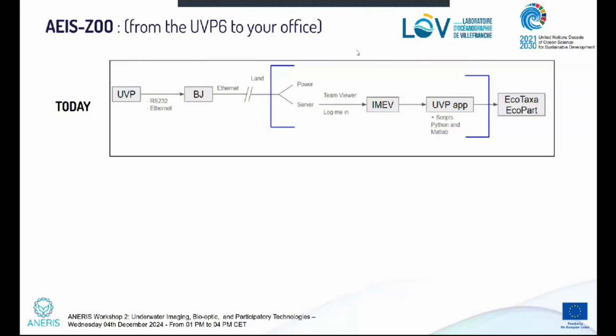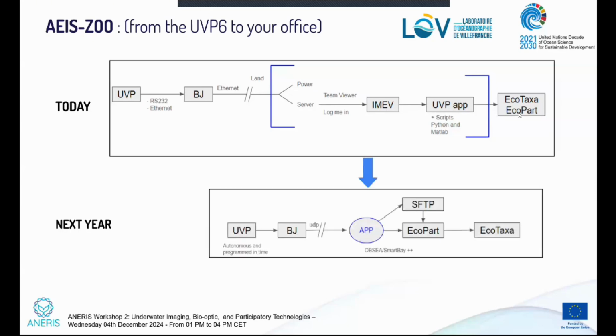Actually, we have to connect using a remote desktop application to download the data, process them, and import them in the EcoTaxa and EcoPart applications that I will introduce. Next year, there will be an application which will automate all this process.